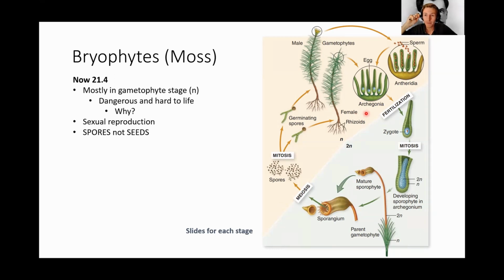That's important to know. Okay, that's just why. That's why they avoid the sun. So gametophytes, all nice right here, they move on to Antheridia and Archegonia. Those are the two sexual structures we'll look at on slides. So gametophytes, they're different gametophytes. So one gametophyte will make an Archegonia and the other will make an Antheridia.